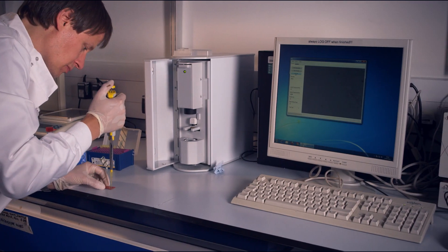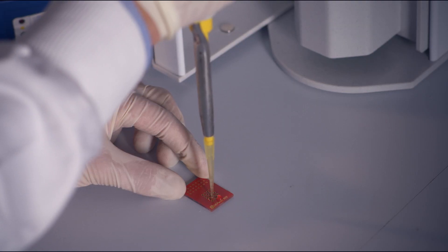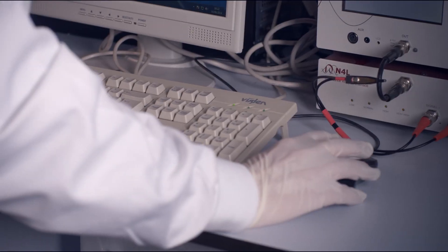So for the last 10 years my team and I have been working to try and develop a piece of equipment that anybody could use — that they could simply take a cell sample, put it into a chip, put it into the machine, push a button — and we've finally done that. We call it the 3DEP.